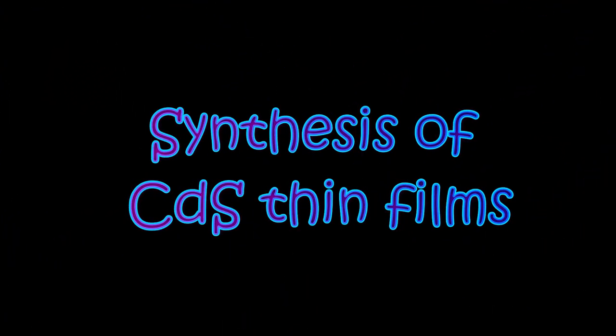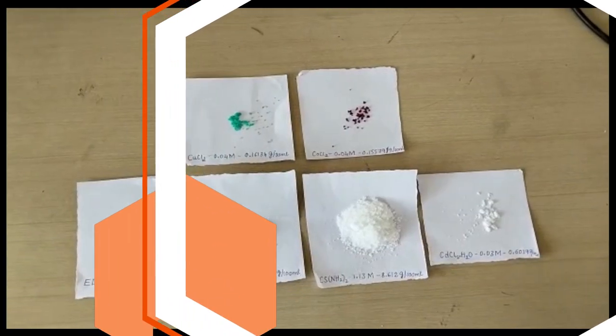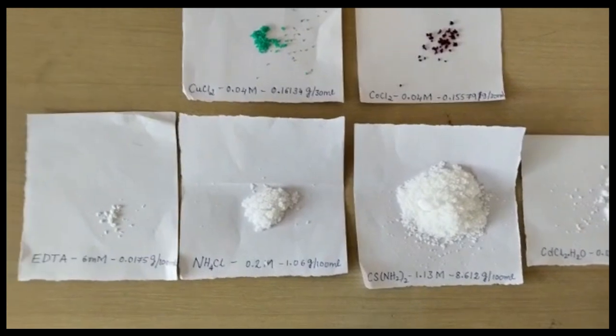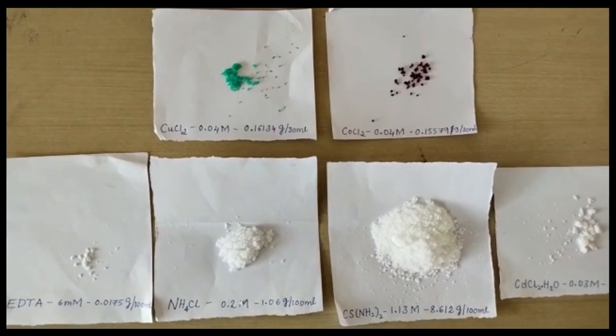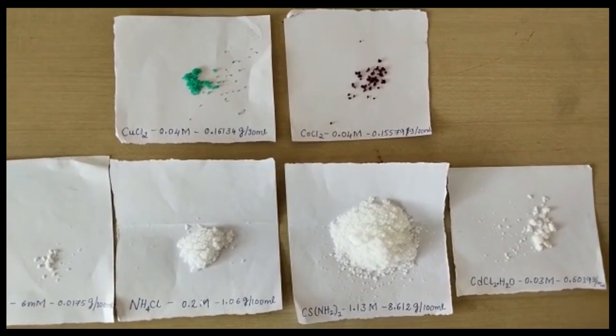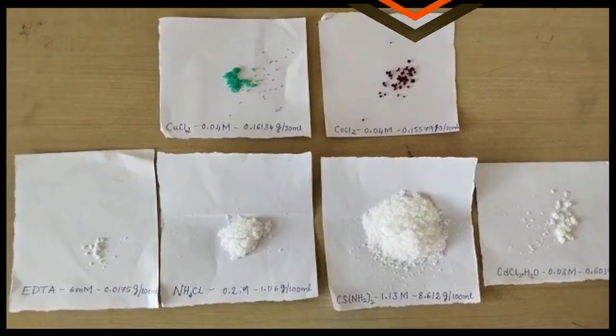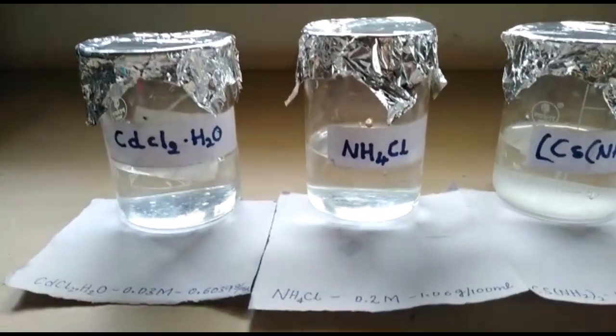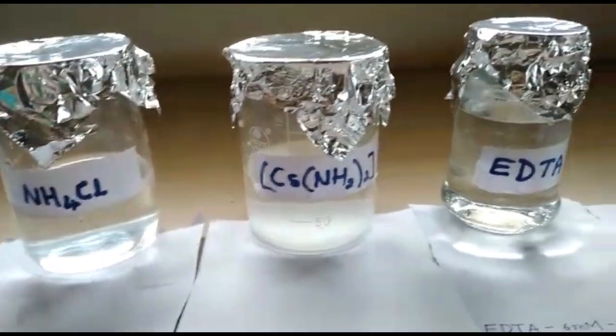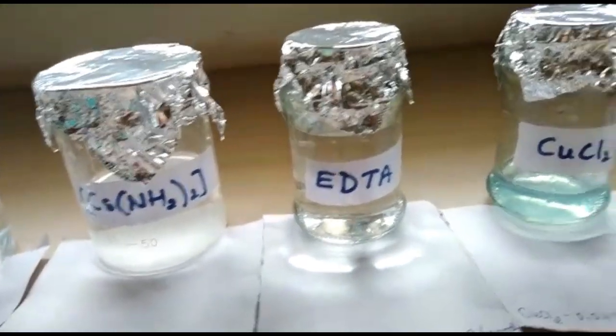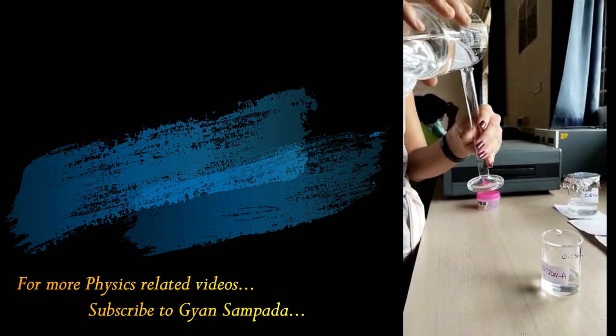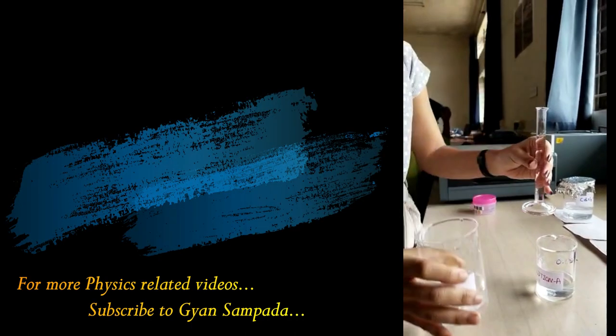We are going to see how we can deposit or synthesize cadmium sulfide thin films. For this, the precursors used are cadmium chloride, thiourea, ammonium chloride, and EDTA. For doping, copper chloride and cobalt chloride are used. In order to deposit the thin film, we need to prepare corresponding solutions of these precursors.